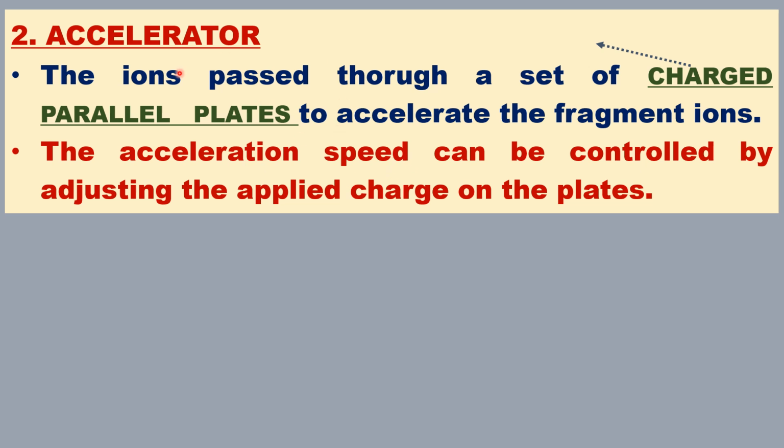Okay, now let us see the accelerator. What is its role in mass spectrometry instrumentation? So this is the accelerator. It consists of several electrically charged parallel plates.